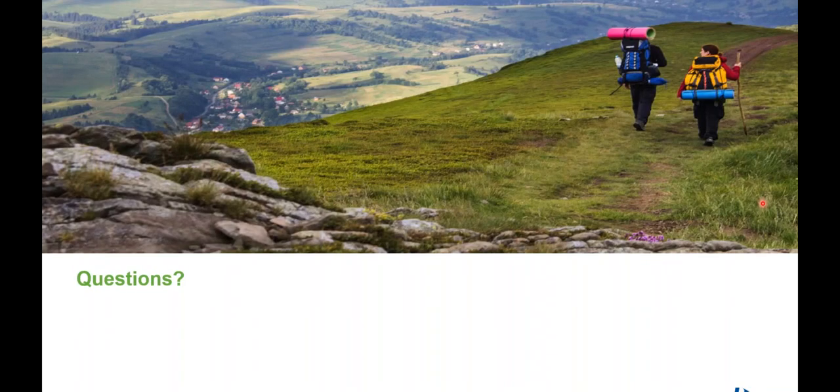Now, whenever you change contact cylinders, it's always a good idea to have 2 sets on hand, because there's always the possibility that something could get damaged when you change the contact cylinders. It's rare, but it's always possible. You want to have another spare set so that you don't end up with a system that you can't use until you get another set. All right, so that is my portion of the talk.